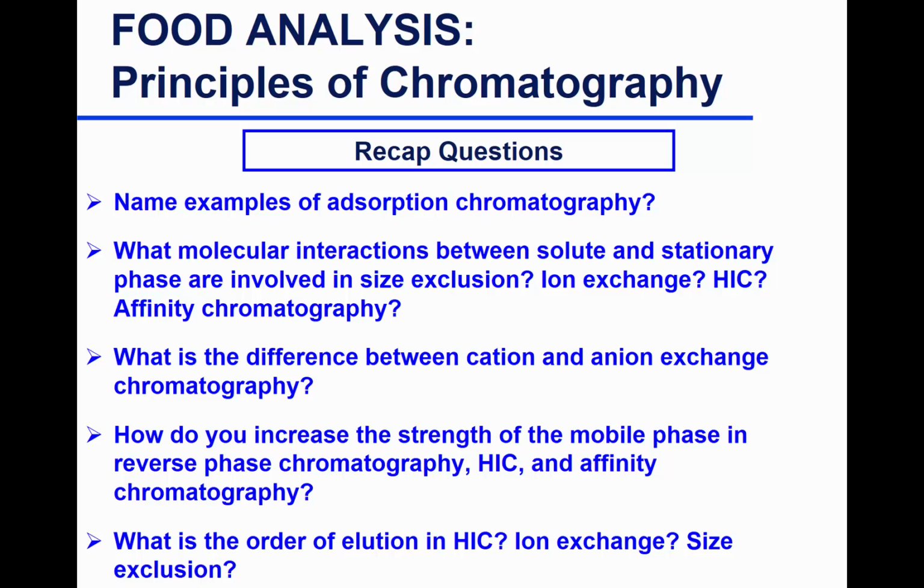Okay, how do you increase the strength of the mobile phase in reverse phase chromatography? What do you do to it? Well, let's see. You guys are good in participation. In reverse phase, do you increase polarity?